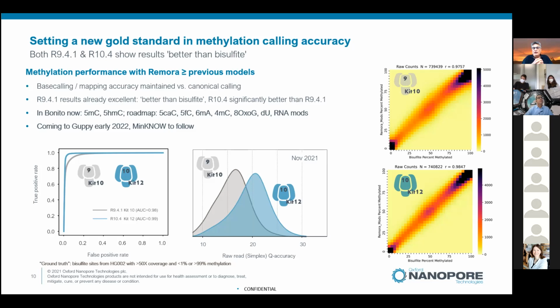This new model, and I'm not sure of how it differs from other models, but it's very GPU light. In fact, it's so GPU light, we're including it with a pending release of our Guppy software for analysis, so that you'll get the nucleotide calling and the methylation calling at the same time in real time by the end of a sequencing run, which I think is really amazing.